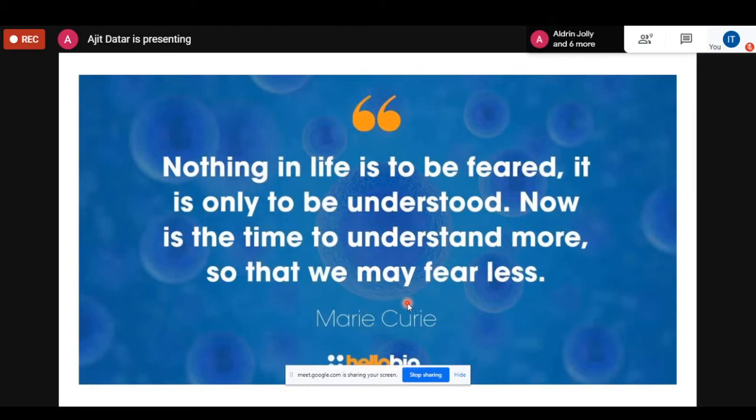And then also if he can have a proper sample preparation and protein purification is possible, he can prepare a single crystal of that protein, then he can use single crystal XRD for very good analysis of the structure of a protein. But it's more complicated. Sample preparation is too stringent there, so he can take help of the people who are working on single crystal XRD, and there are places where it is already there.